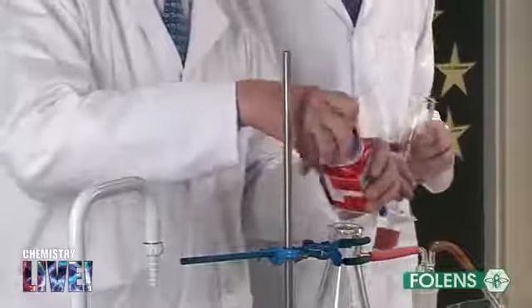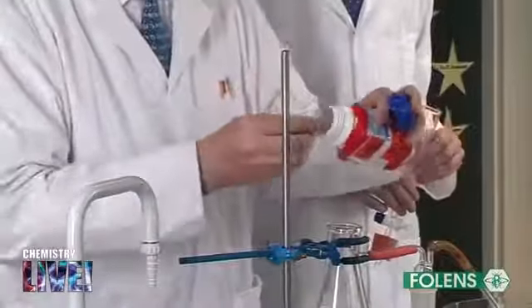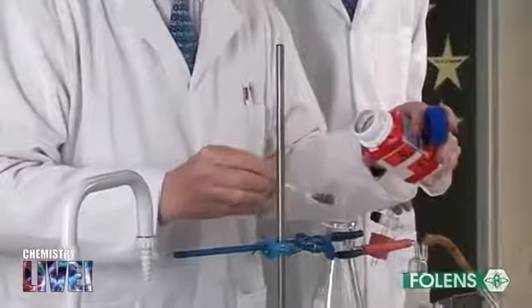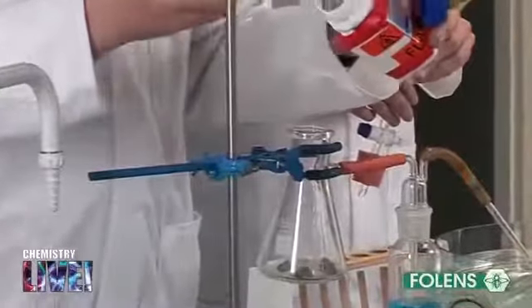No naked flame should be brought anywhere near the gas preparation apparatus. Ethine gas forms an explosive mixture with air. Tests on the gas should be performed well away from the apparatus.